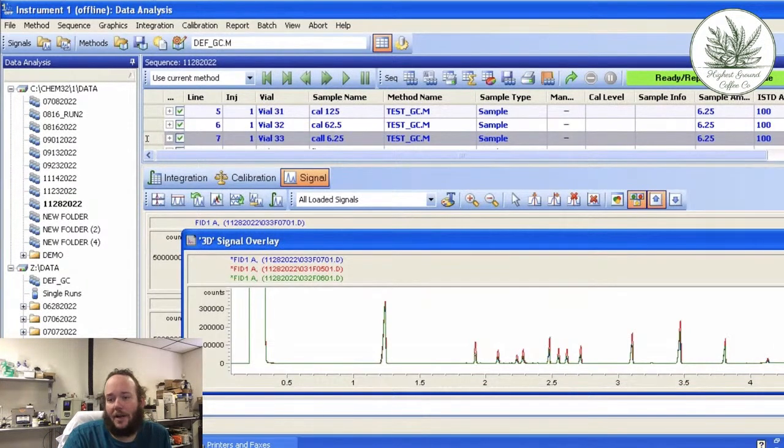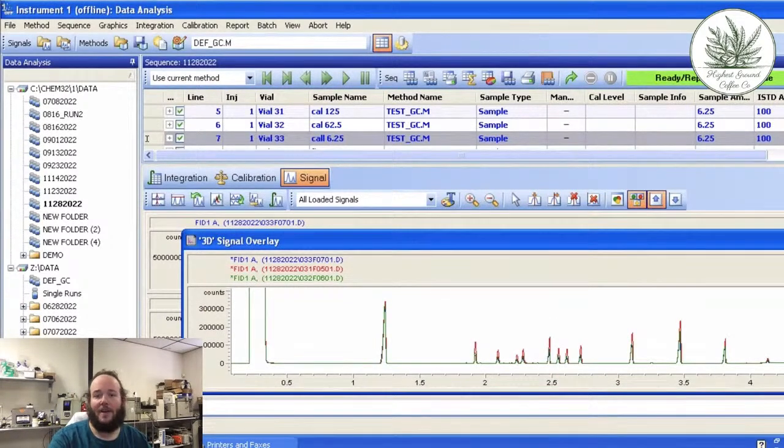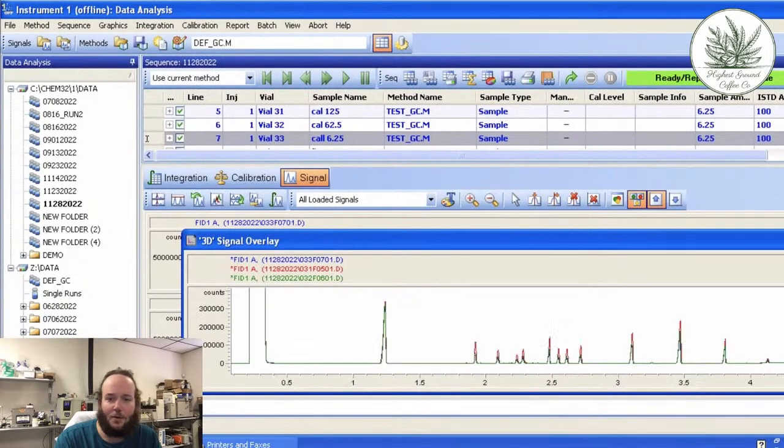So the first thing to note here on these 3 is the internal standard is identical, more or less. That's what we care about. That means none of these injections are inherently discarded based on that. Normally, if we saw big variations here, if you saw one that went down like half or whatever, you generally just discard it and rerun the injection, because it's not close enough, and you don't want to be adjusting 30% for internal standard type stuff. So you don't want to be doing that.